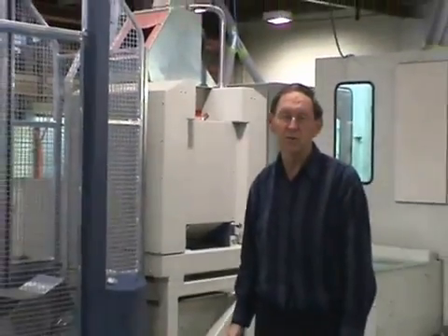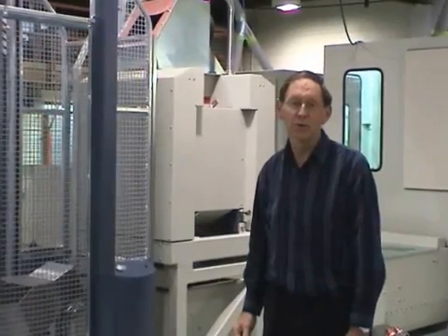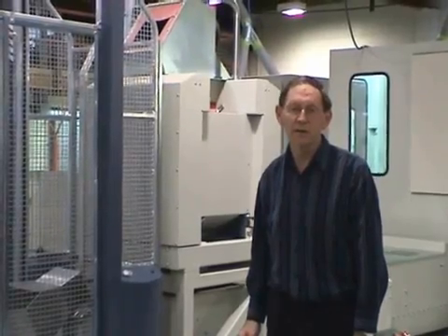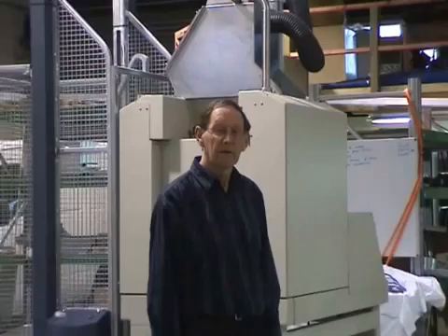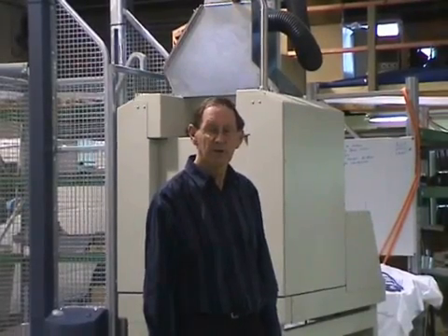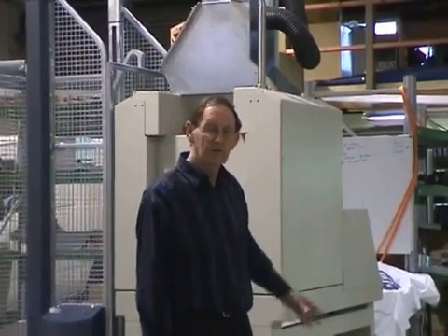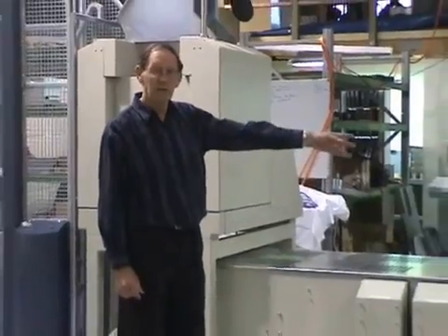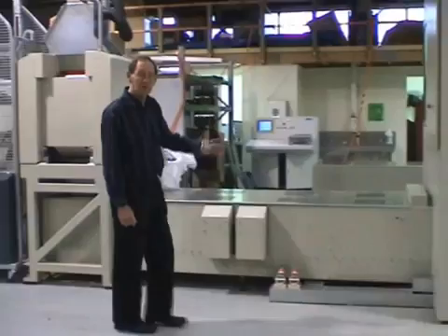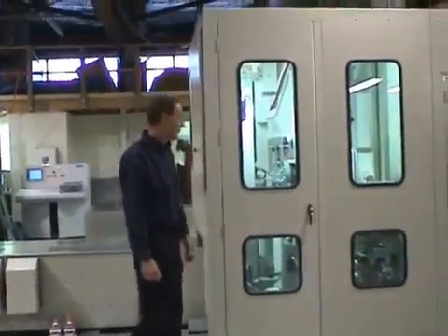The big boy crusher crushes down to around 10 to 15 millimeters, and the sample falls into a sample bin which is travelling on a conveyor underneath. After the sample is crushed, the bin travels along the conveyor towards the other part of the system, and it is lifted up by a bin lifter and dropped into the boy crusher.